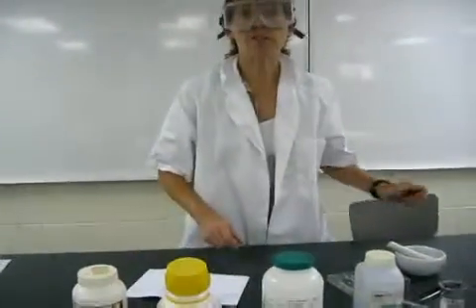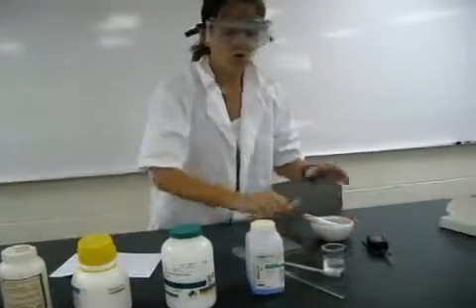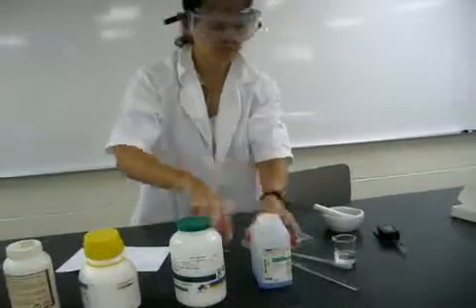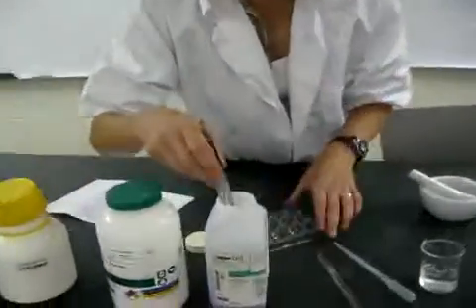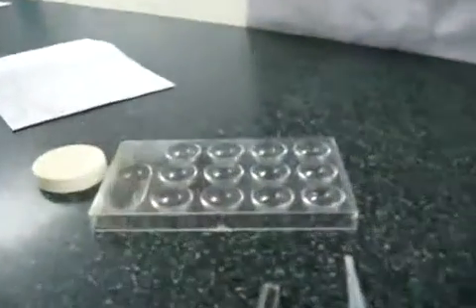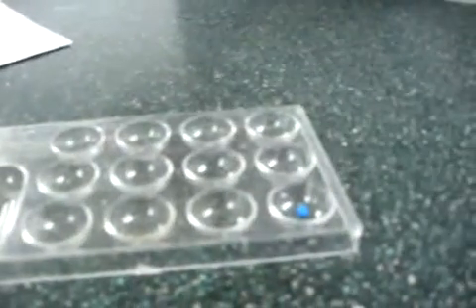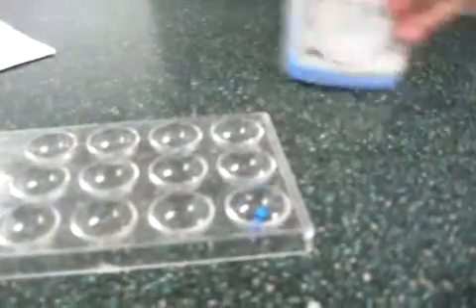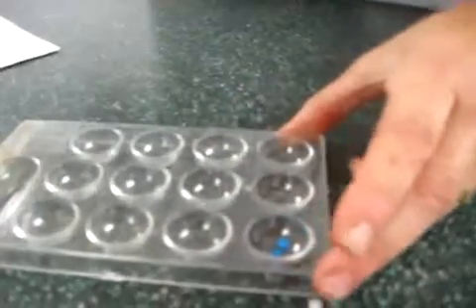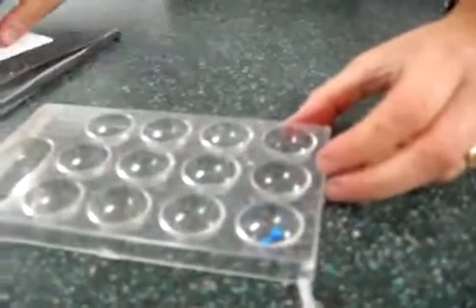Seeing as you already have step 1, your goggles on, you go to step 2, where you collect a small sample of each of the compounds and place it in a well of the spot plate. Instead of just 1, let's collect 2 crystals. Small sample is key. You will continue doing this for all 4 samples.